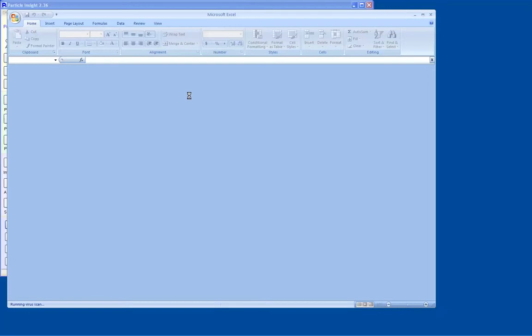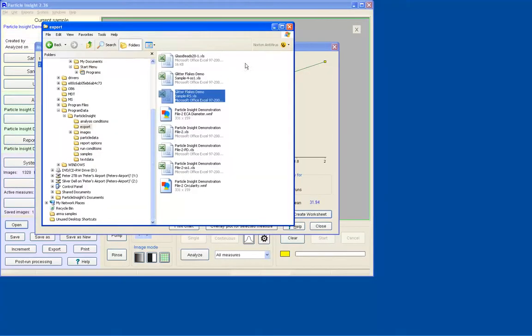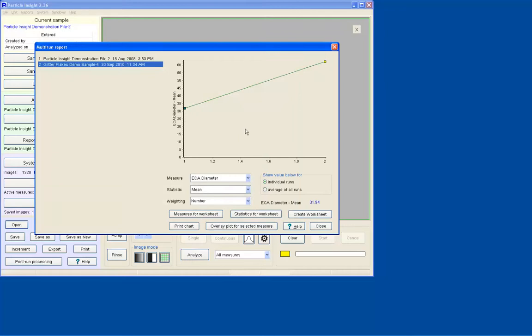And obviously here we only had 2 samples that we're comparing one to the other, but you can have instances where you can have hundreds of samples, and you can have all their means, all their standard deviations. And this is very useful if you want to do any kind of time-stamped analysis, how particles are dissolving over time or growing over time. It's pretty useful. So multiple run summaries, that's another way of having some data output.